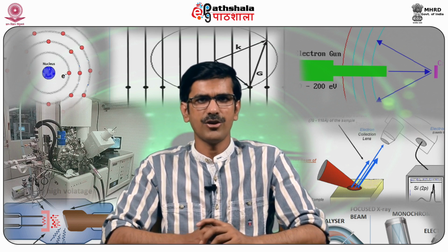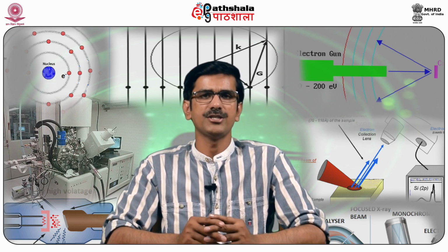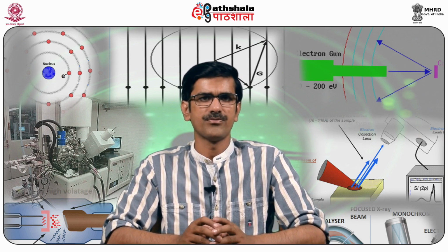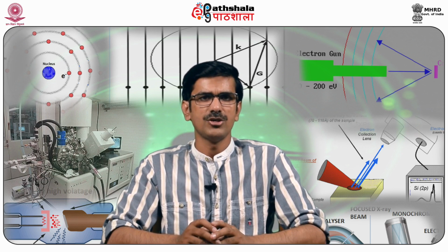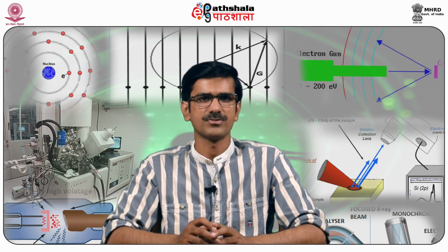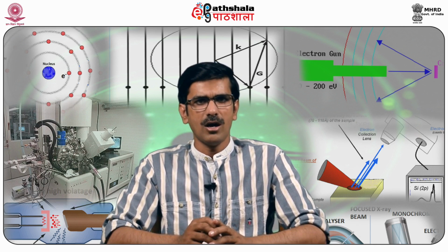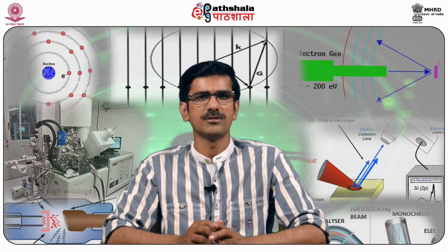Now, the applications of ultraviolet photoelectron spectroscopy. The measurement of molecular orbital energies that can be compared to theoretical values calculated from quantum chemistry. The high resolution allows the observation of fine structures due to vibrational levels of the molecular ion, which facilitates the assignment of peaks of bonding, non-bonding and anti-bonding molecular orbitals. A useful result from characterization of solids by UPS is the determination of the work function of the material.